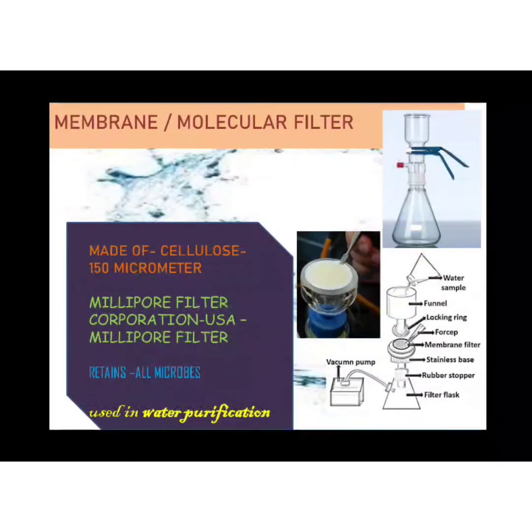Also, I can find out the quality of the sample here, or what kind of organisms were present. If this filter pad is taken, since the microorganisms are collected here, I simply remove this and place it onto a suitable medium on a plate, and then incubate it, and next day after 24 hours check for the growth of the colonies. If there are microorganisms, definitely the colonies will come out. So not only filtration, I can also check for the quality or kind of microorganisms that were present in this particular sample. It is generally used in water purification.